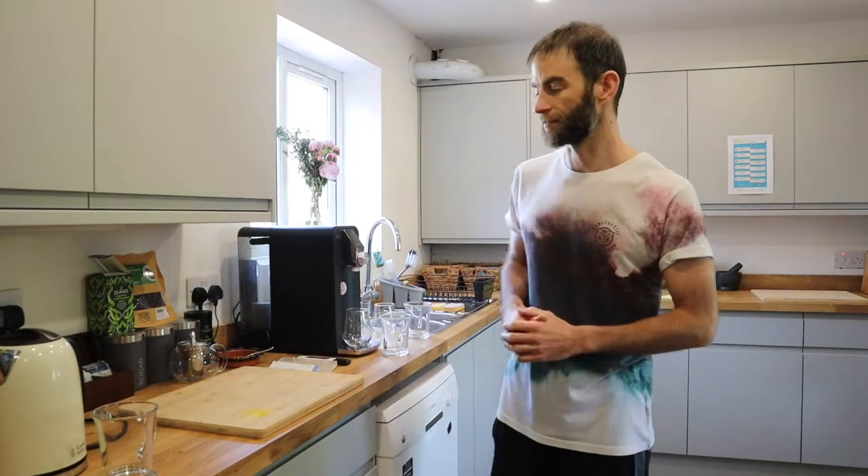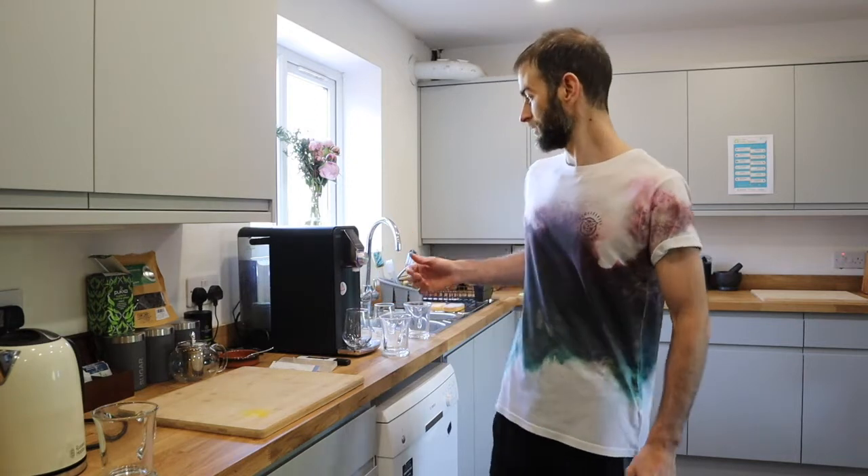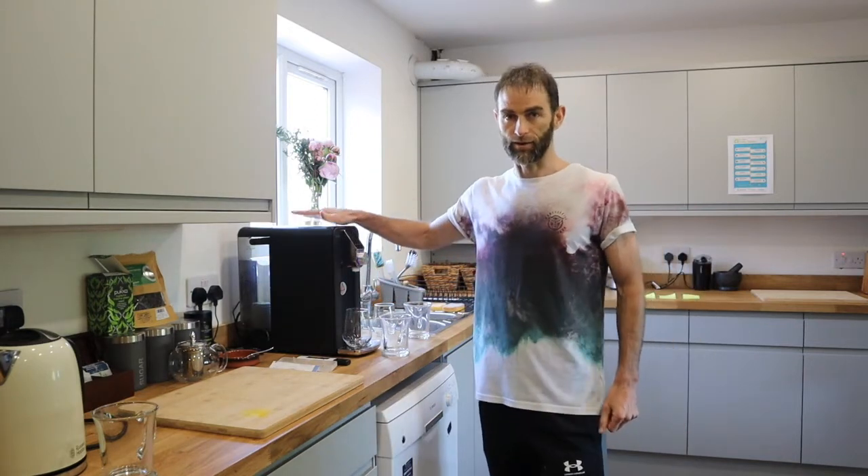In this video I'm going to be testing lots of different water sources in our house, just to give a brief overview of what sort of contaminants your water could contain — obviously comparing it to the Osmio Zero.